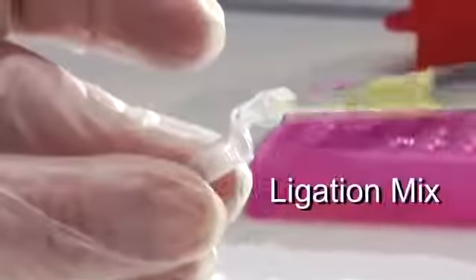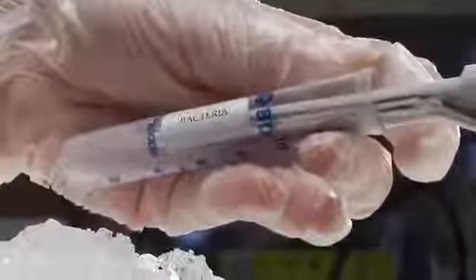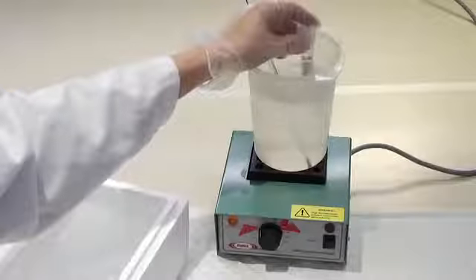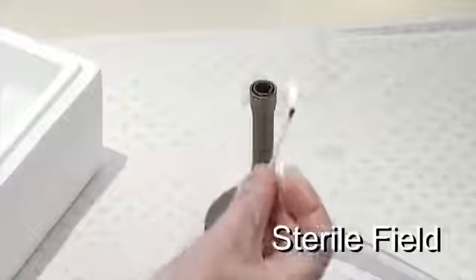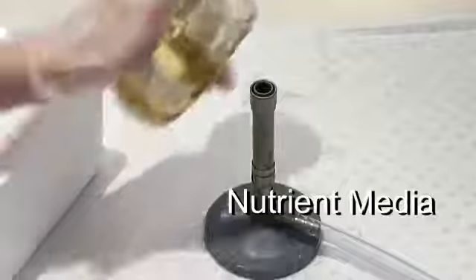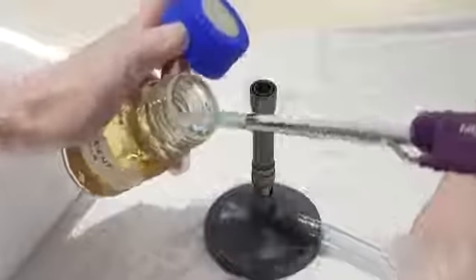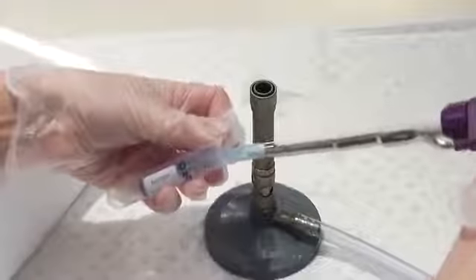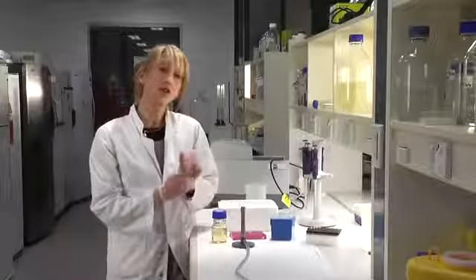The process is called transformation, and it's pretty simple. We just mix the DNA, in this case our ligation mix, with some bacteria that have been made permeable. Then we're going to apply a short blast of heat, just to shock the bacteria into taking up the DNA. We then create a sterile field and take a sample of some nutrient media to add to the mix. Nutrient media provides all of the essential nutrients for bacterial growth. This growth allows the antibiotic resistance gene to be expressed. So I'll just go put this on the shaker.